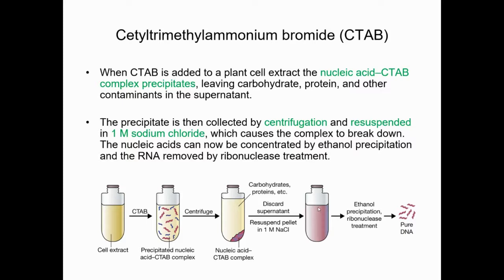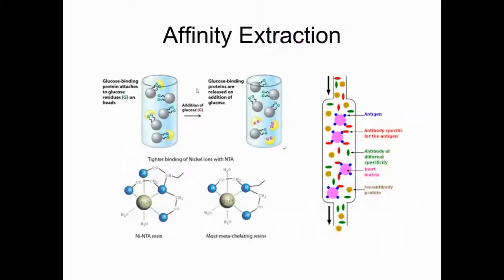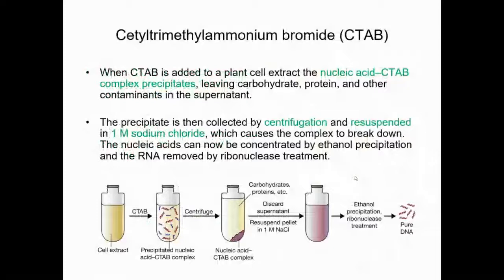And then you can use the same technique here to concentrate your DNA, or you can go through the phenol-chloroform extraction to purify this DNA. Everything will be the same after this step, because this can be the phenol-chloroform extraction plus ethanol precipitation. Just the treatment beforehand will be different.